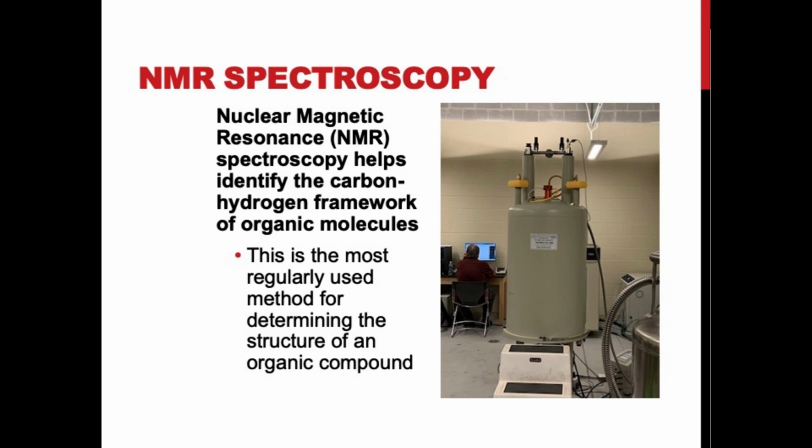And what you see is basically just a great big giant thermos because an NMR has a superconducting magnet in the middle of it. And superconductors are only superconducting at really low temperatures. And the magnets in NMRs are only superconducting at liquid helium temperatures. So this whole big beige thing that you see is basically just a thermos.